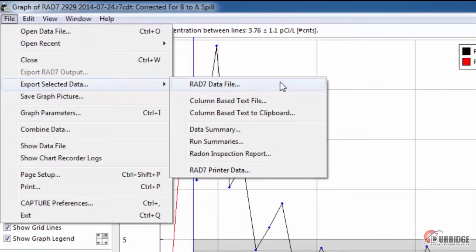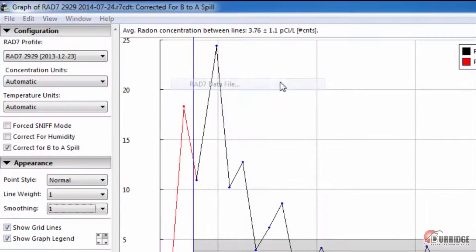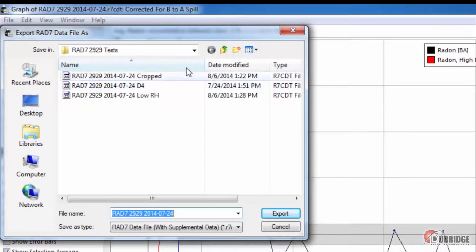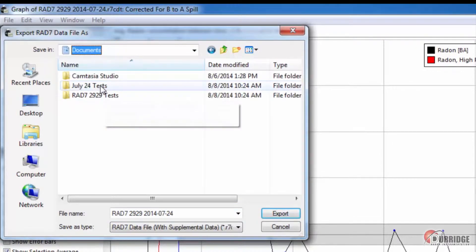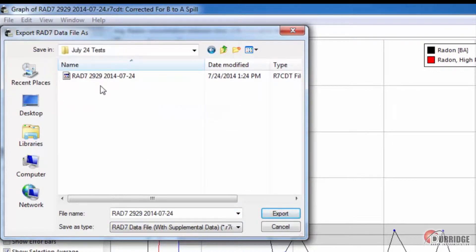Choosing the RAD7 data file saves the data in the graphing format interpreted by Capture. This is the format you download and read your files in, so export it in order to crop the beginning or end points of the data. If you select this option, just pick a location and name to save the file.